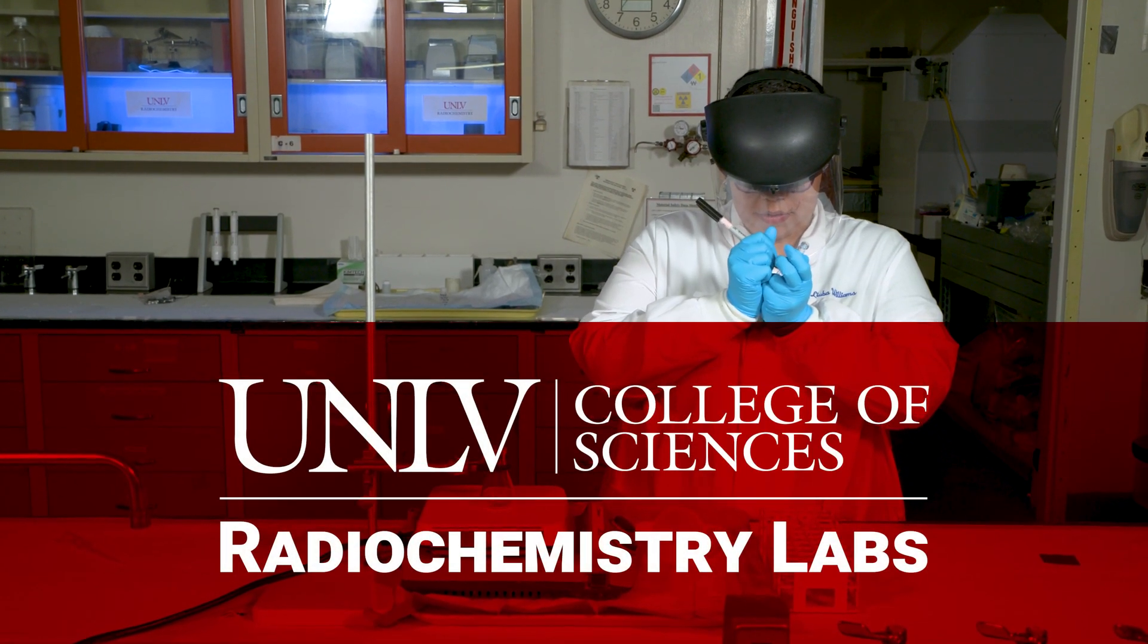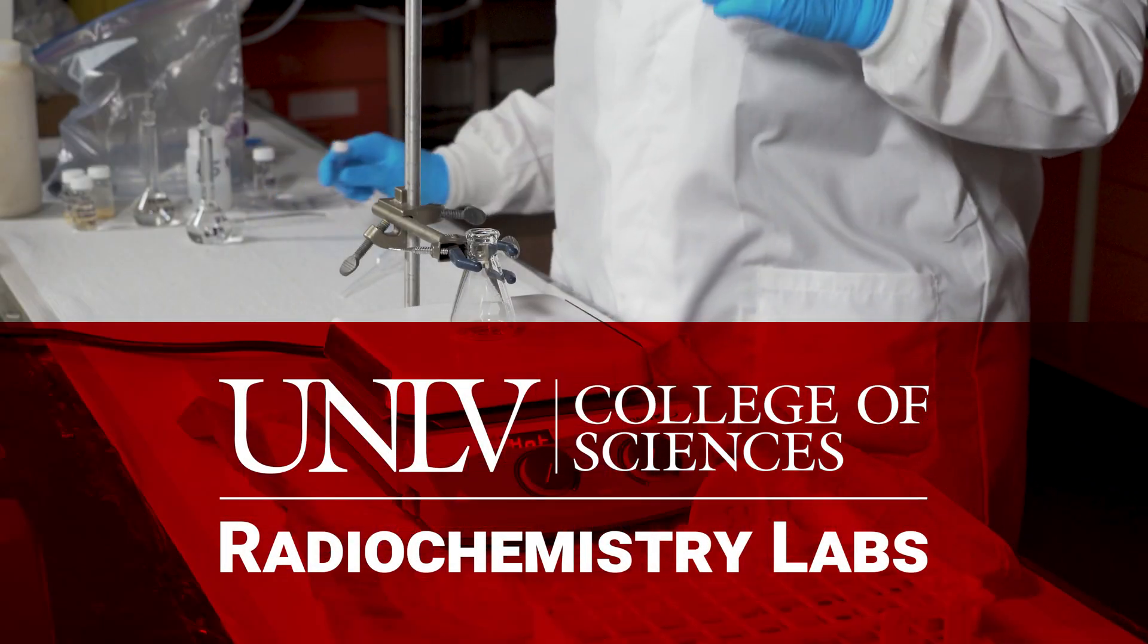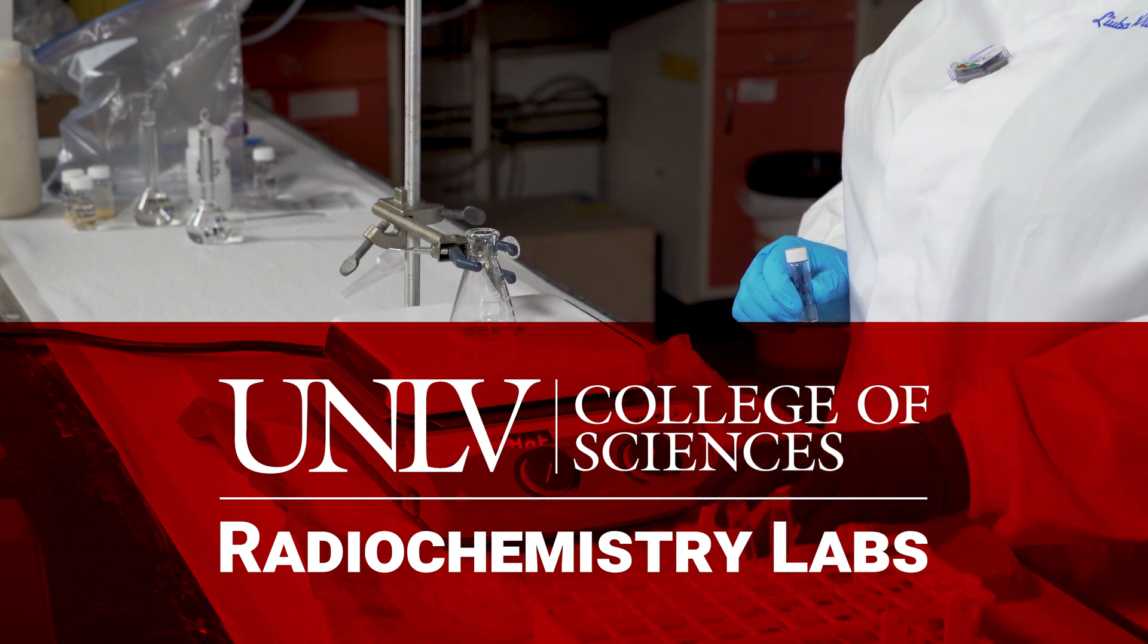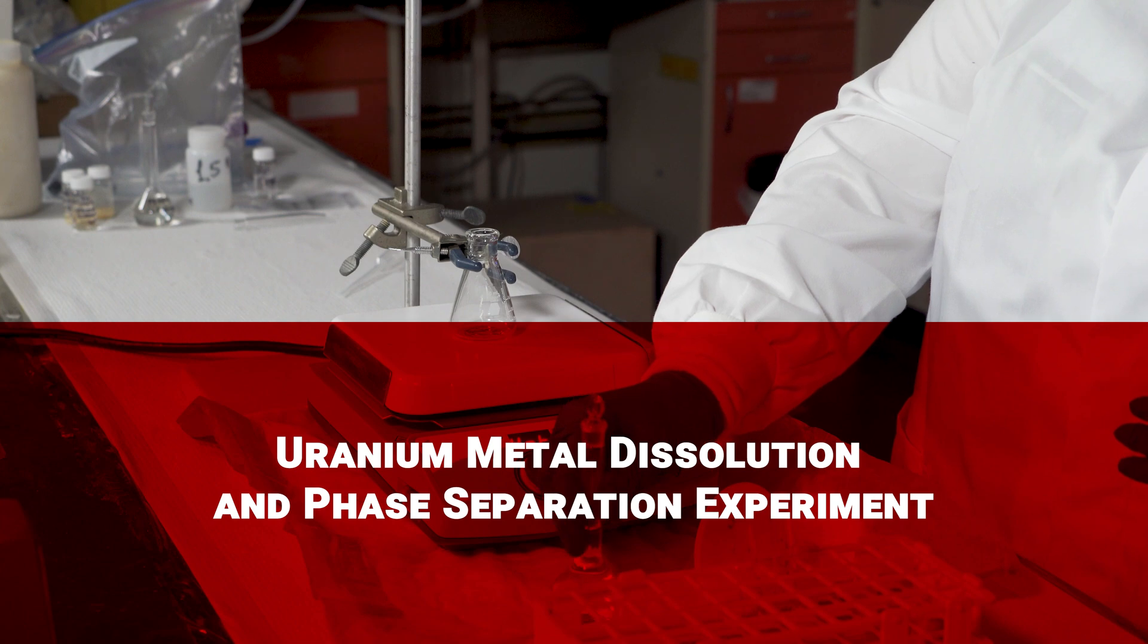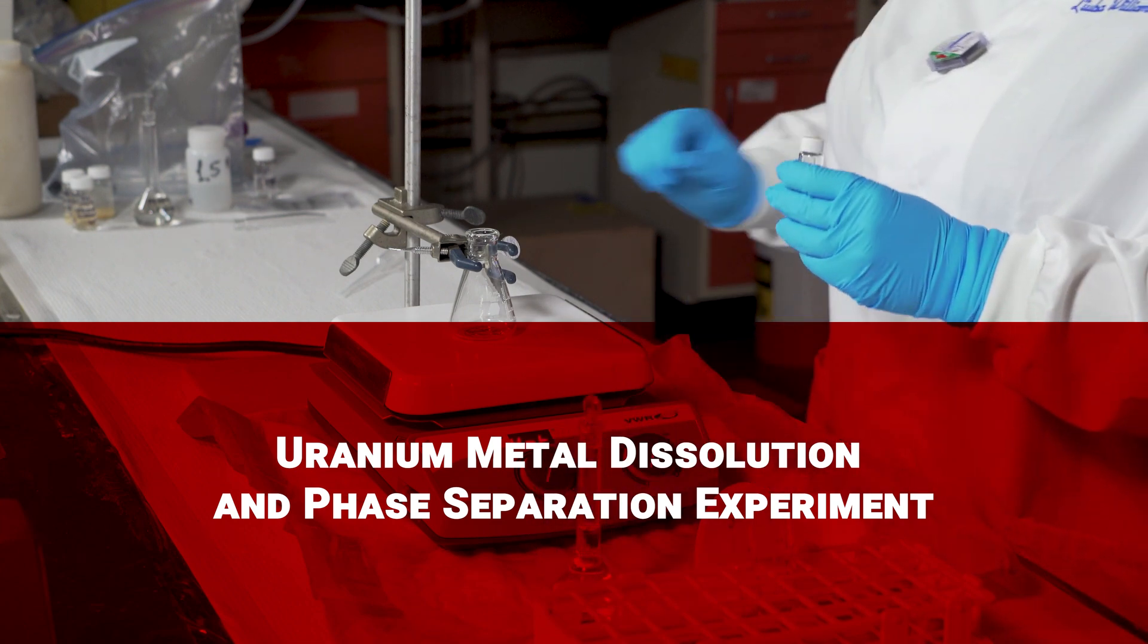In this video, we will demonstrate the dissolution of uranium metal and acid. We will then go over the process of preparing uranyl nitrate before demonstrating a separation with the acidic organic extractant tributyl phosphate.